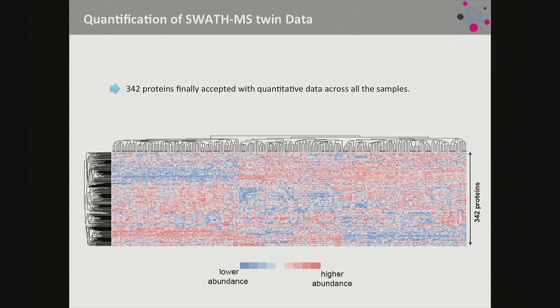He quantified persistently about 340 proteins. This may not seem a very high number for you after this course, but it is actually a remarkable number for plasma, because we did not want to fractionate the plasma, nor did we want to deplete it. We wanted to just take the plasma and digest it, to have a minimal number of potential artifactual variability introduced experimentally. Okay, anyway, that's the data set.